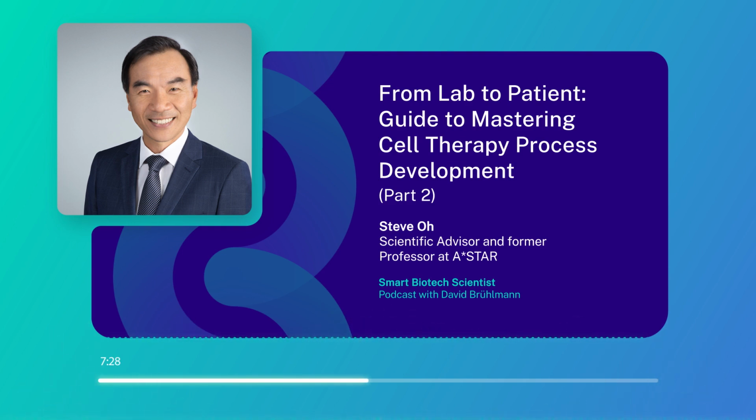Which is very low. But if you can get the cells to respond well at that power number 1, 25 RPM would work at 1,000 liters. So that's a very practical use of fluid dynamics. I don't personally so much study the detailed micro eddies and mixing eddies of the reactor themselves, but the overall power number is what I use for scale.